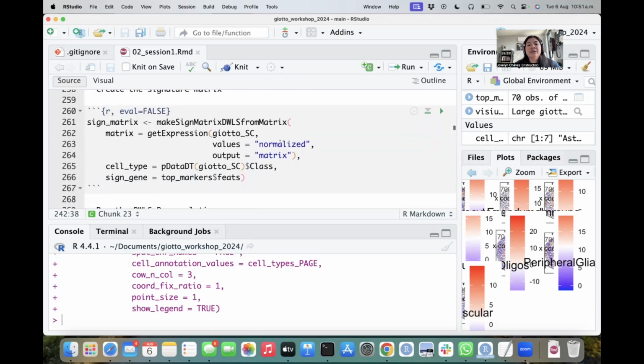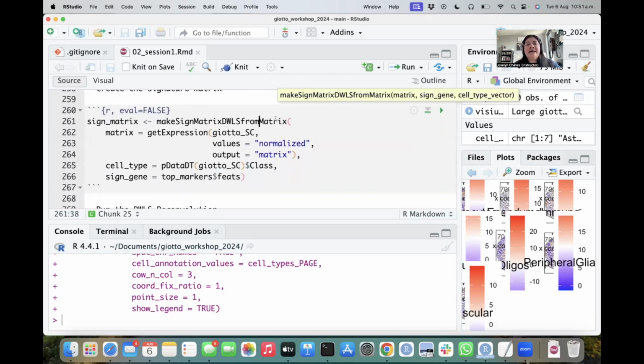Now, of course, it could be that a spot is 99% of a particular cell type, let's say. So it's almost for sure that this spot is only composed of a single cell type. But when we have a region, specifically like in the transition of two different cell types in the tissue, then of course we cannot assume that the spot corresponds to only one cell type.